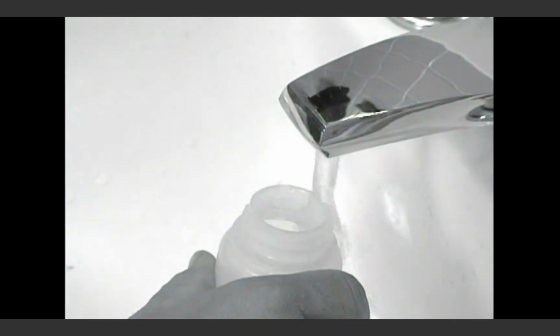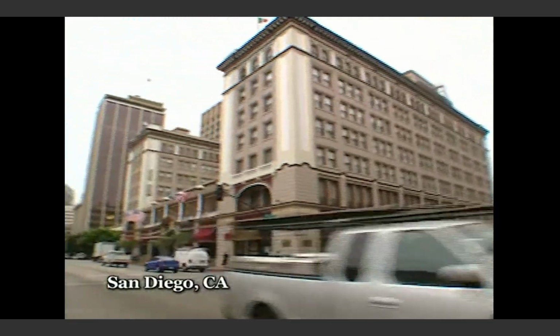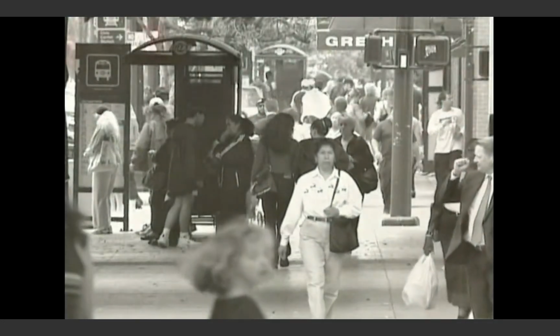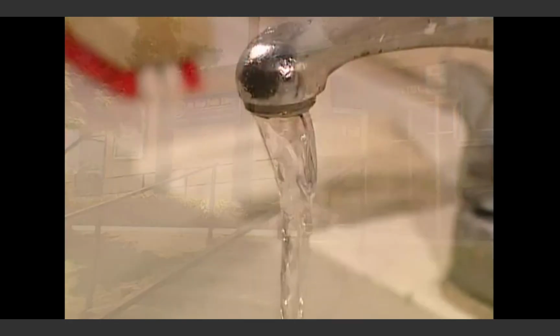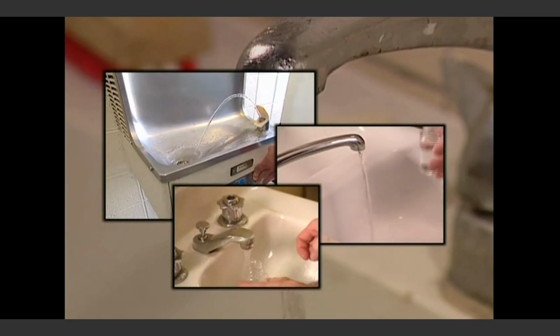Here's an example to illustrate how faucet contamination can affect sampling results. A few years ago, the City of San Diego Water Department had an incident of total coliform positive tests, not alarming, but still unusual compared to past experiences and thousands of tests a year. The problem was traced back to samples taken in schools, libraries, and community centers where the water was being collected from drinking water fountains, kitchens, and bathrooms.